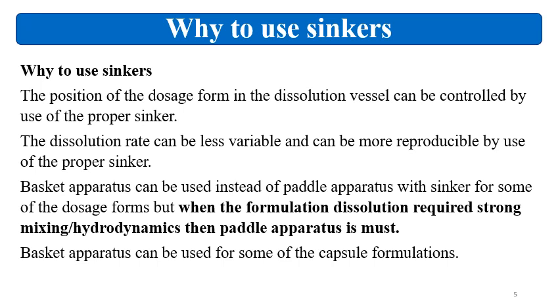And if in the paddle apparatus the formulation shows movement like spinning, dancing or sticking to the vessel, then the use of a sinker is very necessary. Basket apparatus can also be used for some capsule formulations, but whenever development is done for dissolution, that is when apparatus selection is done, and if you select the paddle apparatus over the basket apparatus, then use of sinkers may be necessary if the formulation requires.